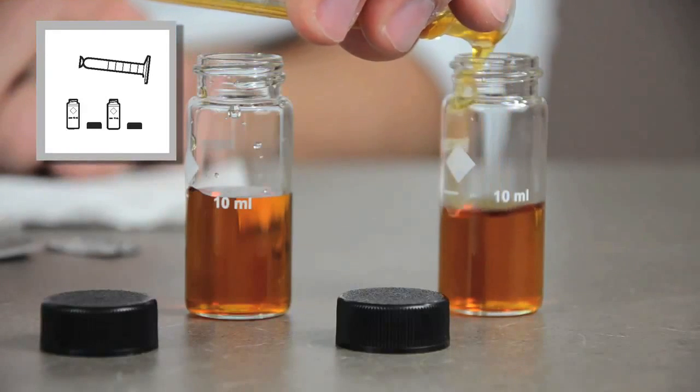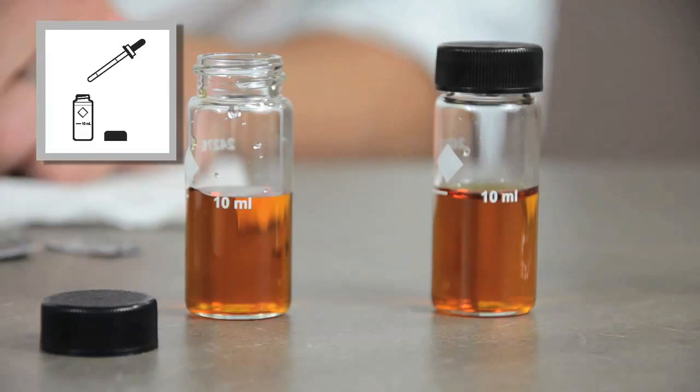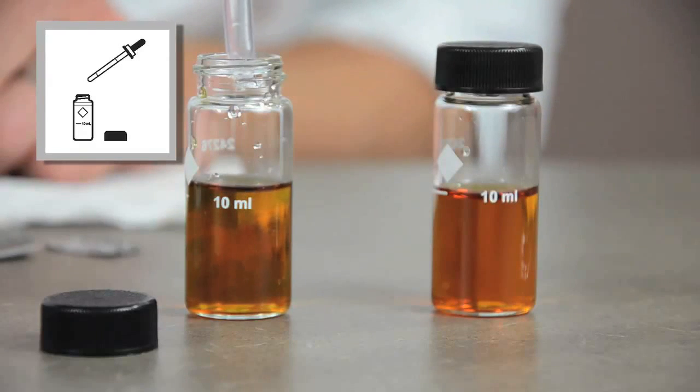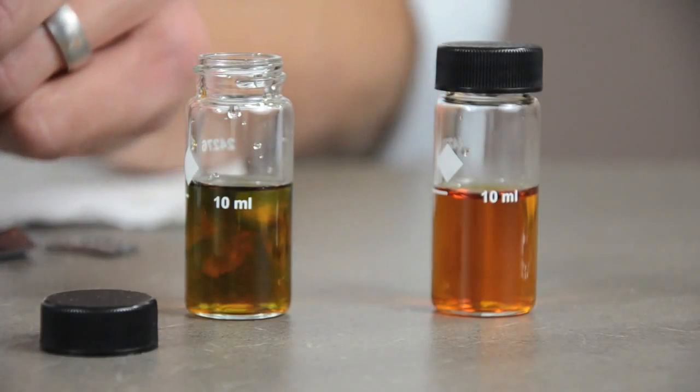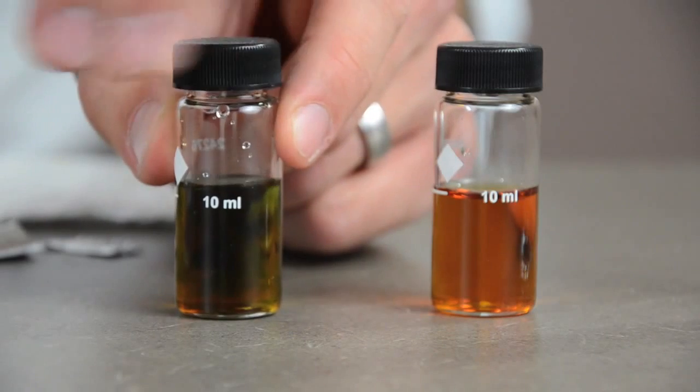Cap one of the cells. This is the blank. Using the calibrated dropper, add 0.5 milliliters of molybdenum 2 to the sample. Cap the cell and swirl to mix.